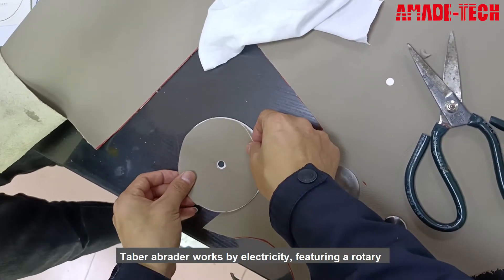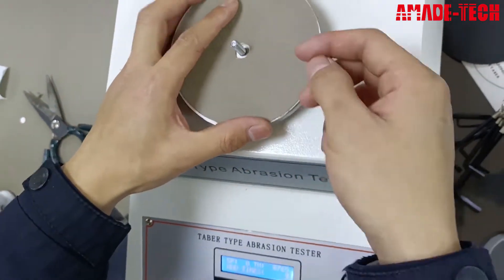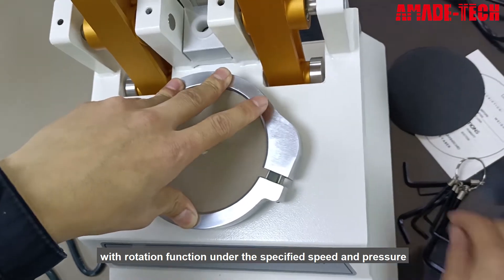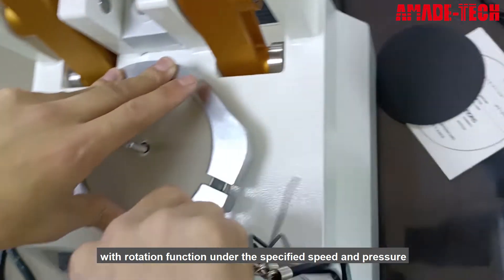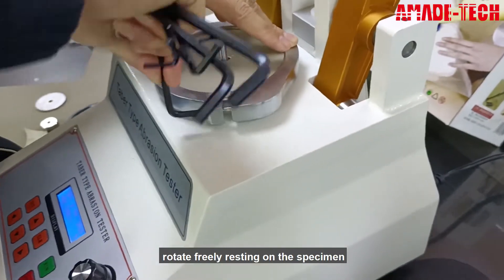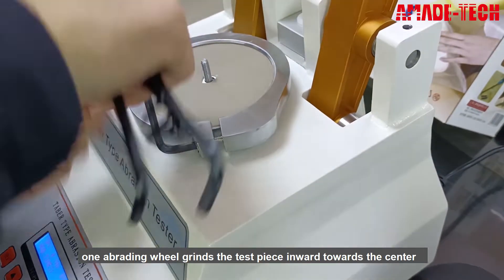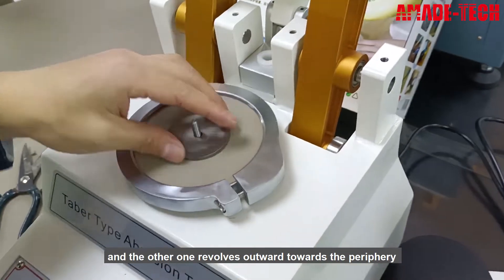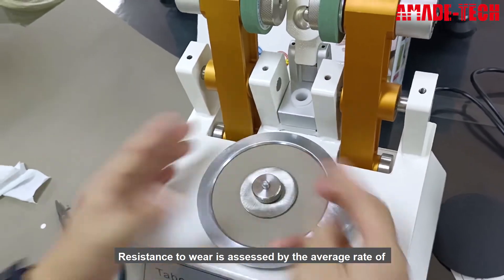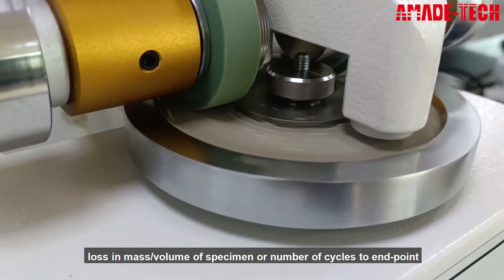Tabor abrader works by electricity, featuring a rotary platform and double abrasion wheels. A test piece is mounted to the round turn plate with rotation function under the specified speed and pressure. Two abrasive wheels attach to the free end of pivoted arms and rotate freely resting on the specimen. One abrading wheel grinds the test piece inward towards the center, and the other revolves outward towards the periphery. Resistance to wear is assessed by the average rate of loss in mass/volume of specimen or number of cycles to endpoint.